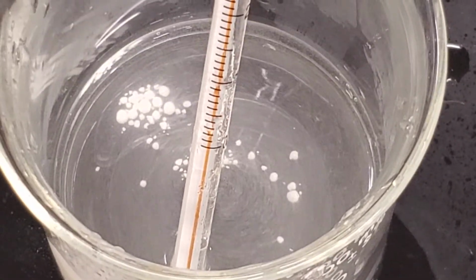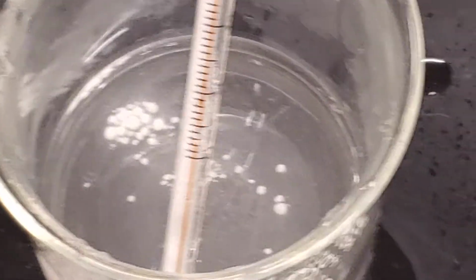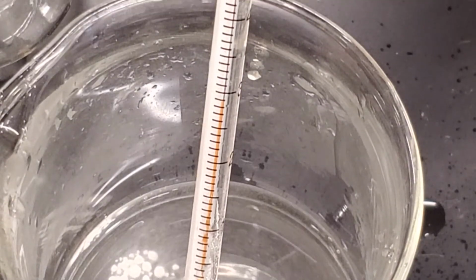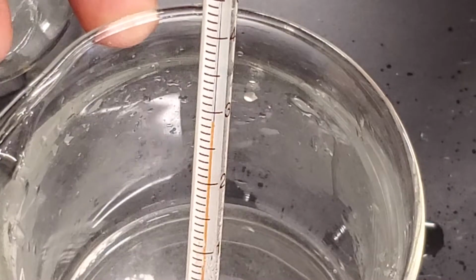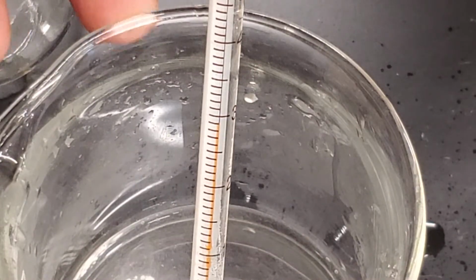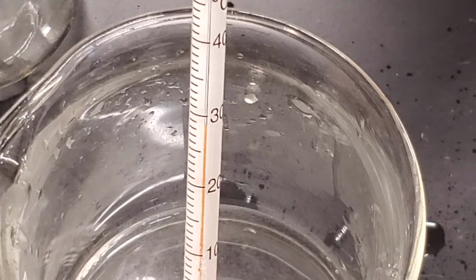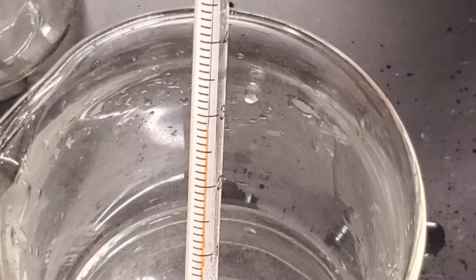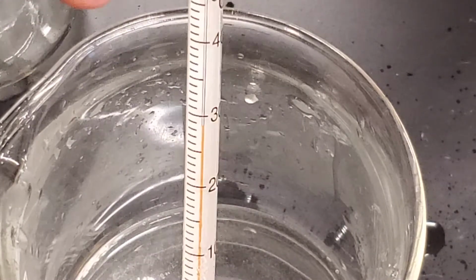The little white dots is just the powder that hasn't yet dissolved. And then of course we need to take a look at the temperature. I think we have about 30 more seconds of this temperature before we can officially call it done. The longer line there is the 30-degree line. So we are currently 1 smaller hash mark below 30.